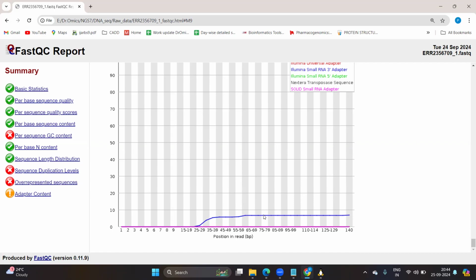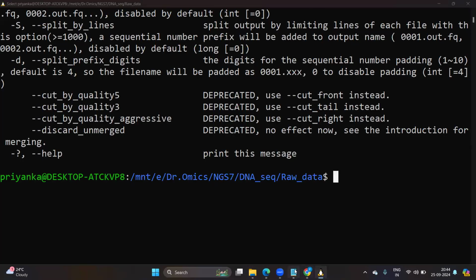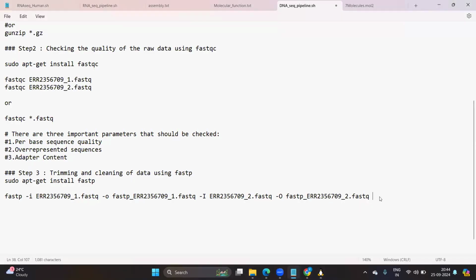So instead of providing those 6 sequences in the command, we can write all the sequences into a FASTA file, and that file we can provide. And how can you provide it? With the help of one option, --adapter_fasta, and after a space, you can provide that file name.